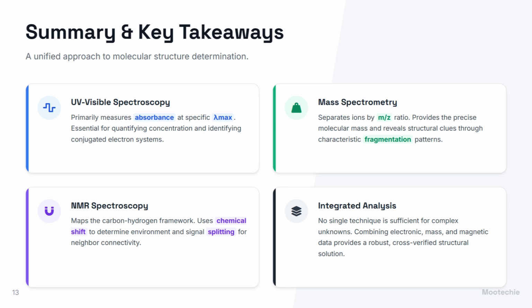And the most important message is on integrated analysis. No single technique is sufficient for complex unknowns. Combining electronic, mass, and magnetic data provides a robust, cross-verified structural solution.